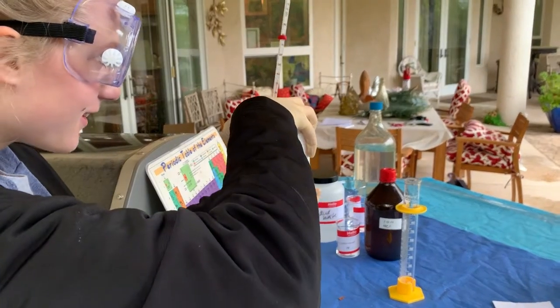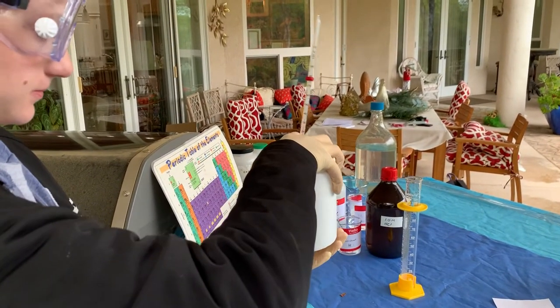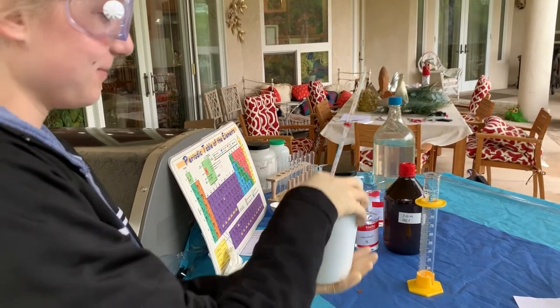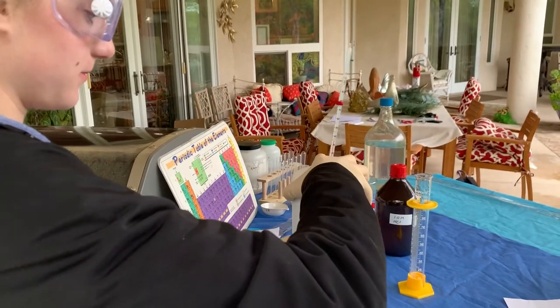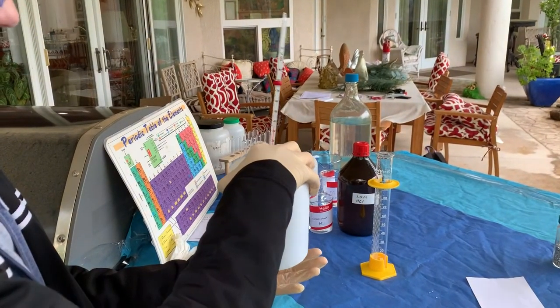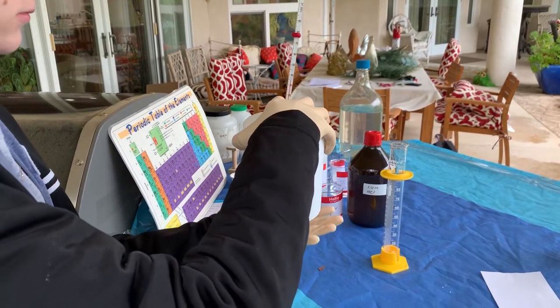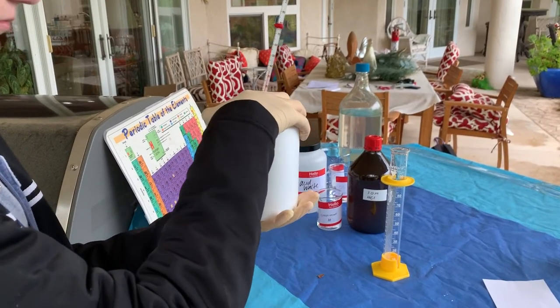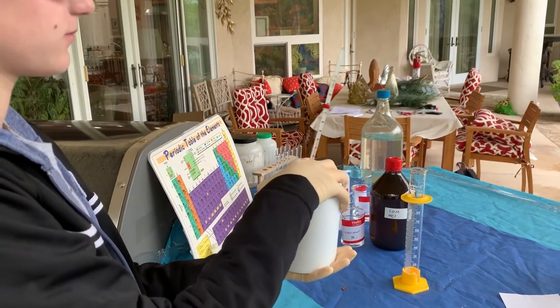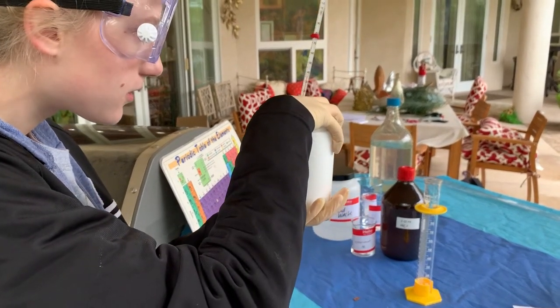Look at it leveling out. Still 33. 34 degrees Celsius. Still 35. 36 degrees Celsius. Still 37 degrees Celsius. Still 37.